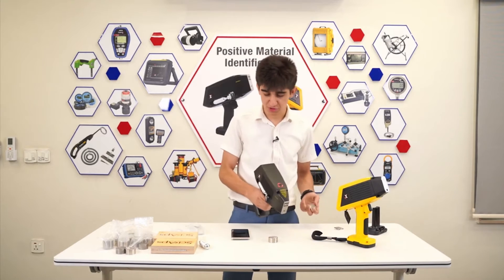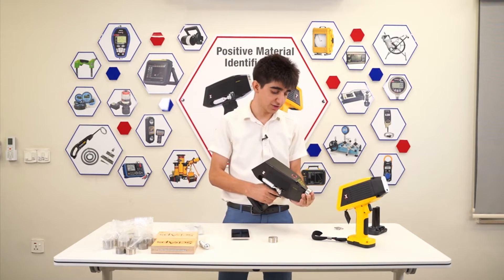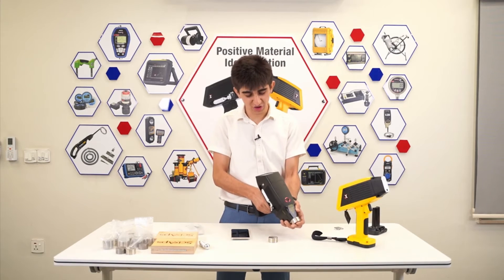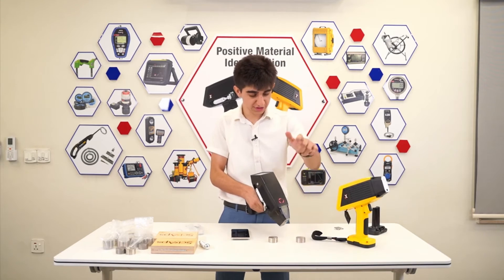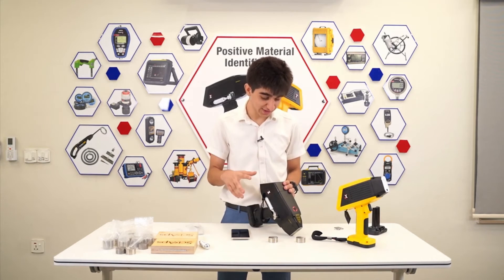Running the test on the LIBS is also pretty easy and straightforward. Just put the sample there and press the trigger — that's it. Wait for the unit to do its thing. Right now, we're pre-burning the sample surface and then running the tests. For this specific unit, we have set the number of tests per trigger to 3. We run 3 tests per trigger and get the average for all. Test number 3 is done. I put the sample away and press Save, and we instantly get the grade match.